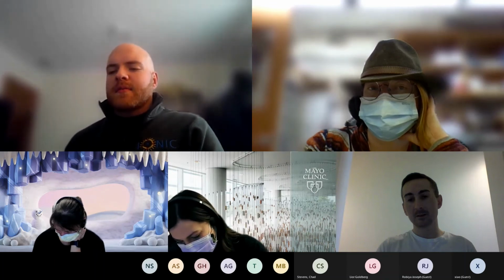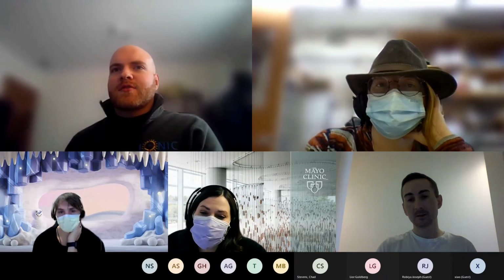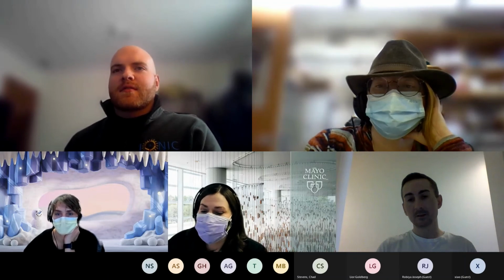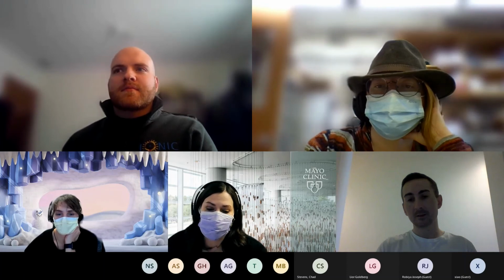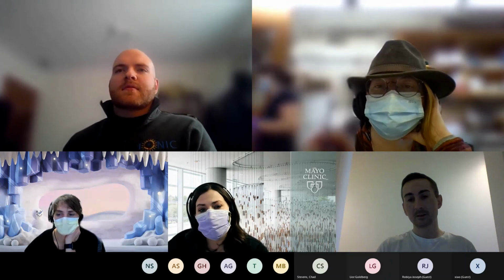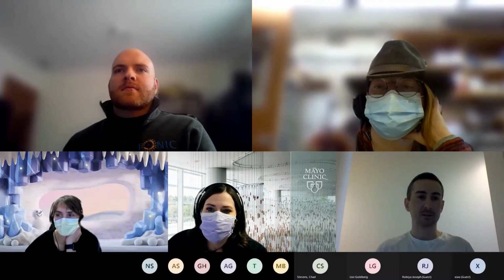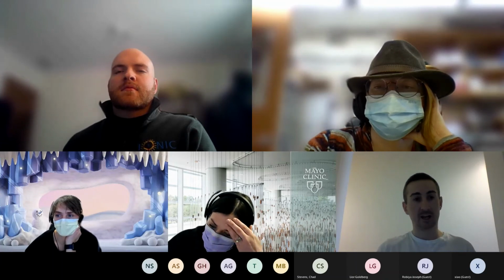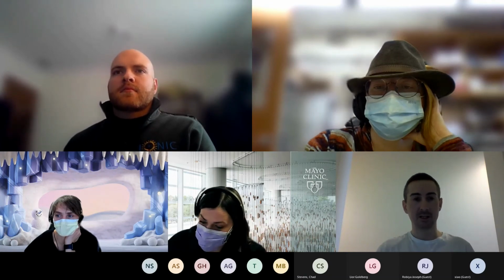Ben, have you experimented with doing any sort of fixation to account for some of the sample storage concerns that you saw? Trying different fixatives and fixing conditions, do you mean? Yes. No, we've just used the manufacturer's recommended dilution of the lyse fix buffer, and that's what we've stored the samples in.